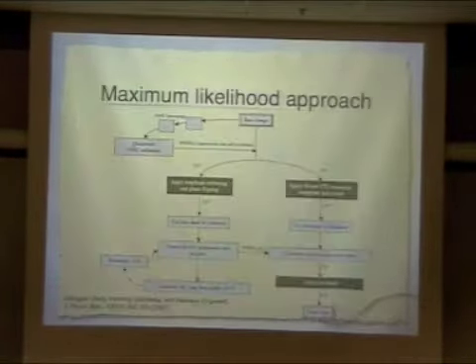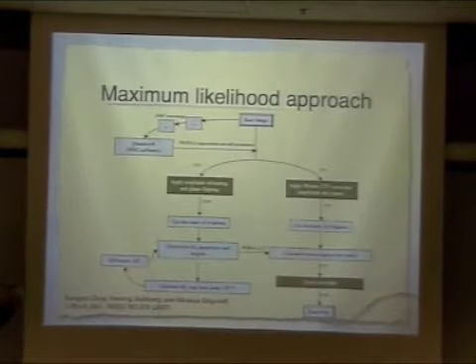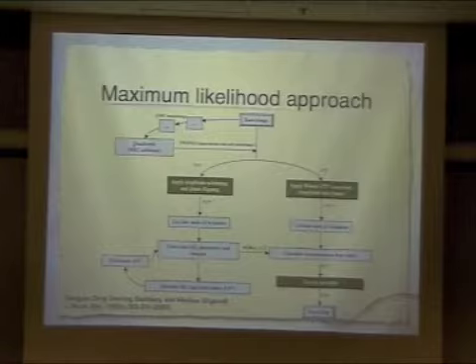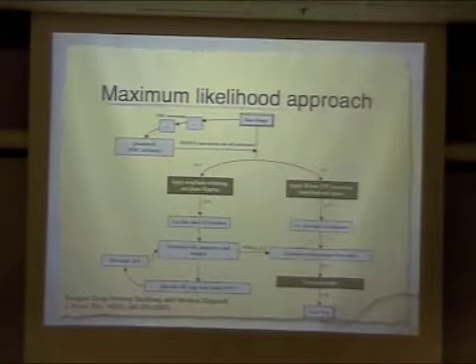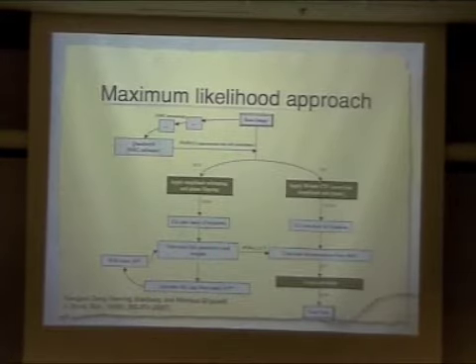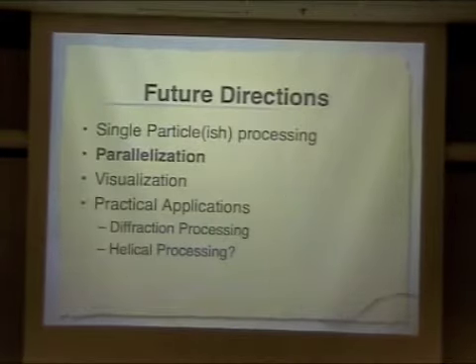One we're working on is maximum likelihood. I'll say nothing more than just showing you this slide, since Henning will be going over this. But again, we're doing something similar, where we're trying to take advantage of the fact that we know where the particles are, and we know a lot of other data about them. Can we, in either real space or Fourier space, apply mathematical tools that finally give us a better map? I'll let Henning talk about that more.